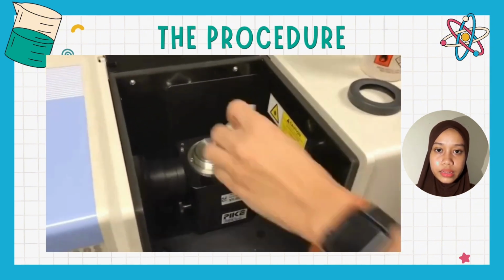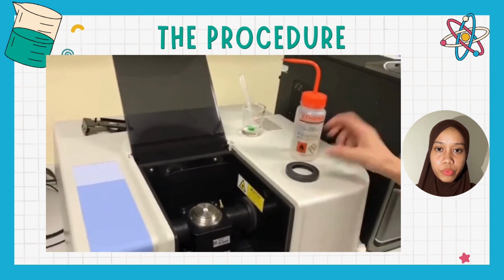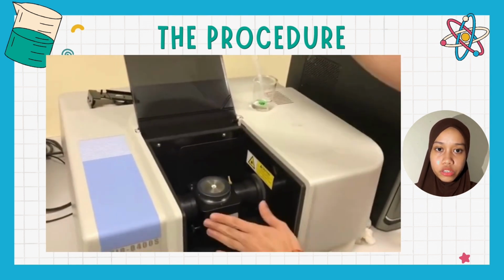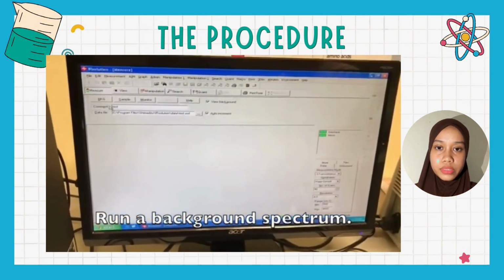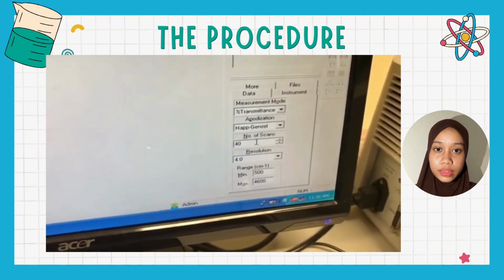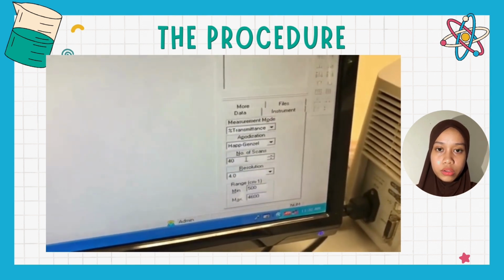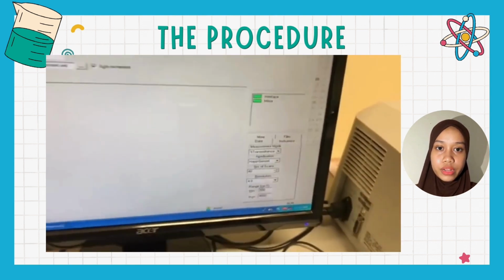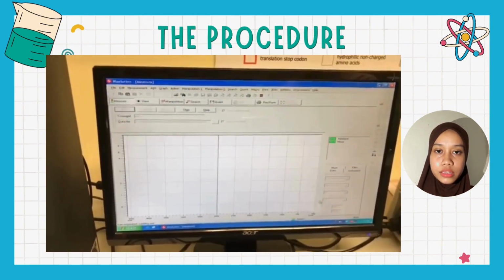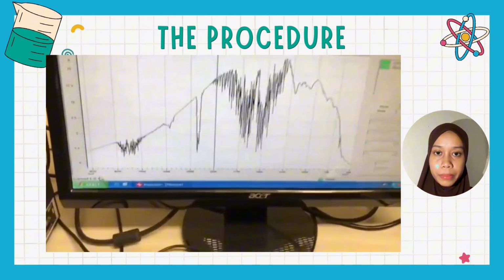After that, data analysis. Compare the sample spectrum with the spectral library to identify components. Analyze the spectrum peaks to determine functional groups in the sample. Last but not least is cleaning. Wet a tissue or cotton swab with ethanol. Wipe the surface of the stage evenly and make sure to clean all surfaces that come in contact with the sample.